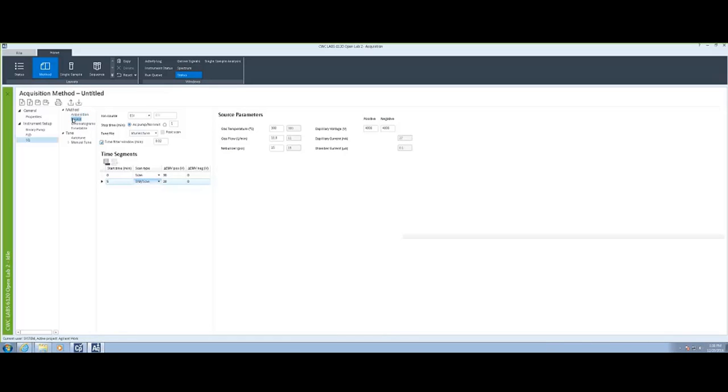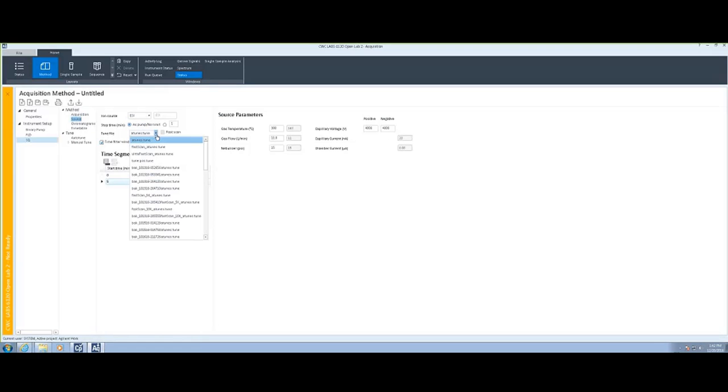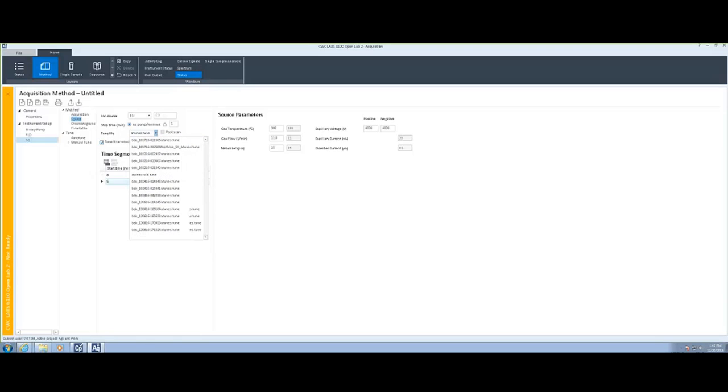The source defines the type of source that the mass spec will be using. ESI, APCI, or multimode are all available. Additionally, there is a tune file that's available to make sure that your mass spec is operating appropriately.